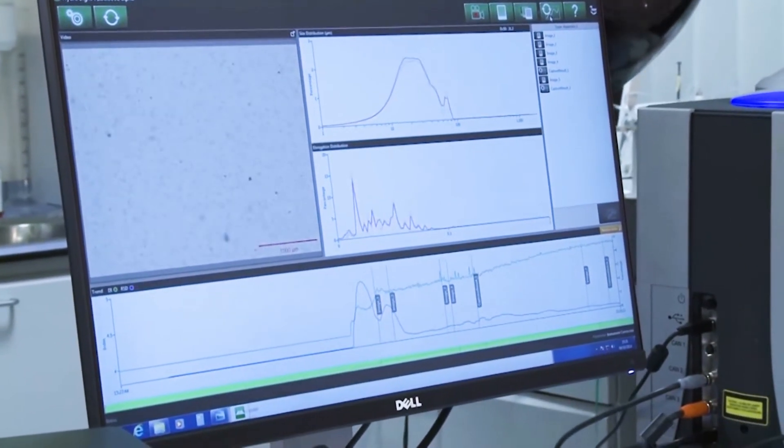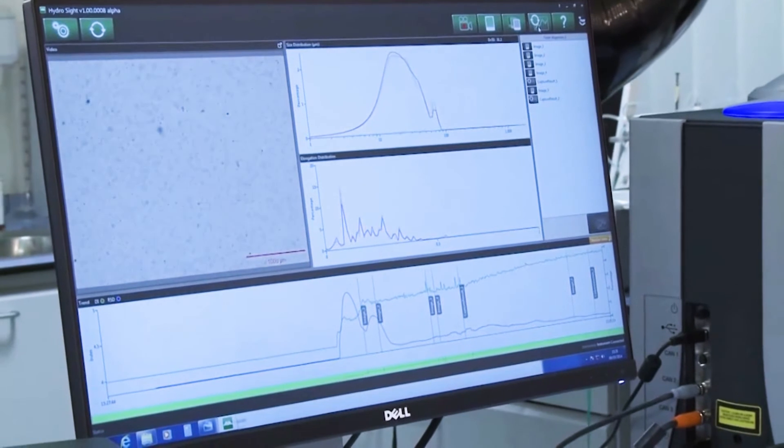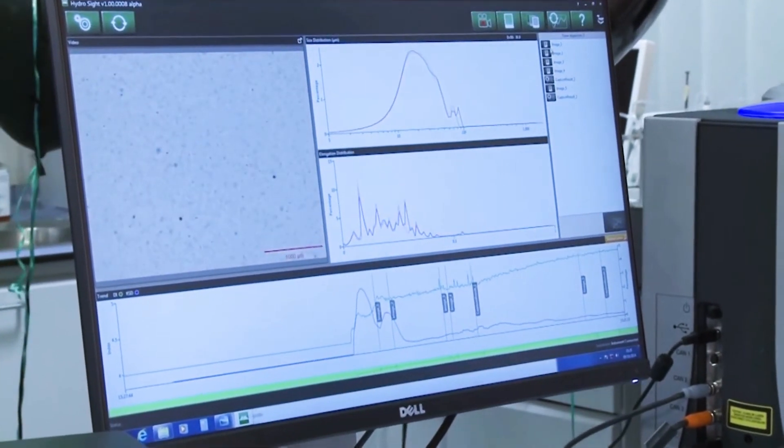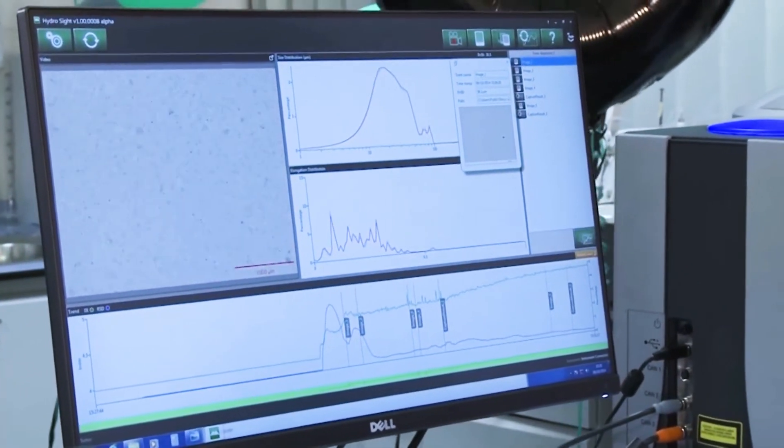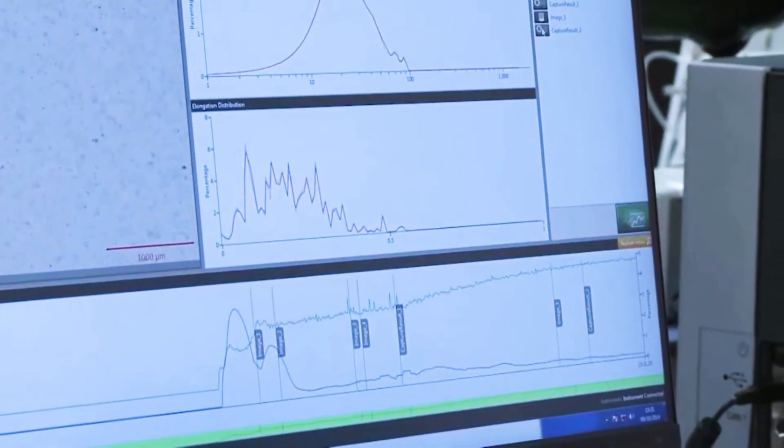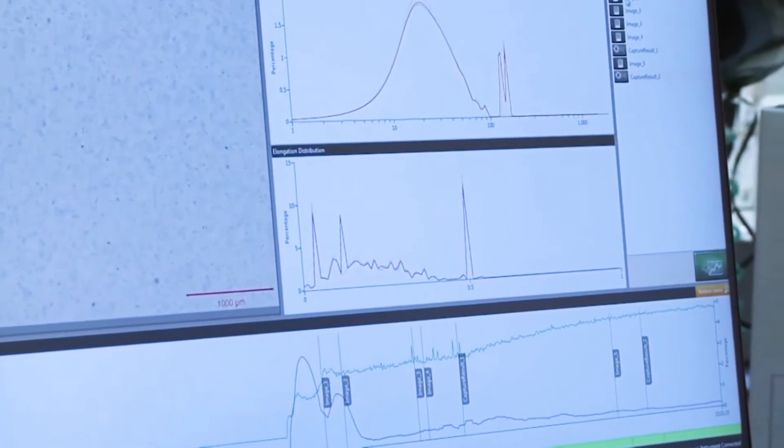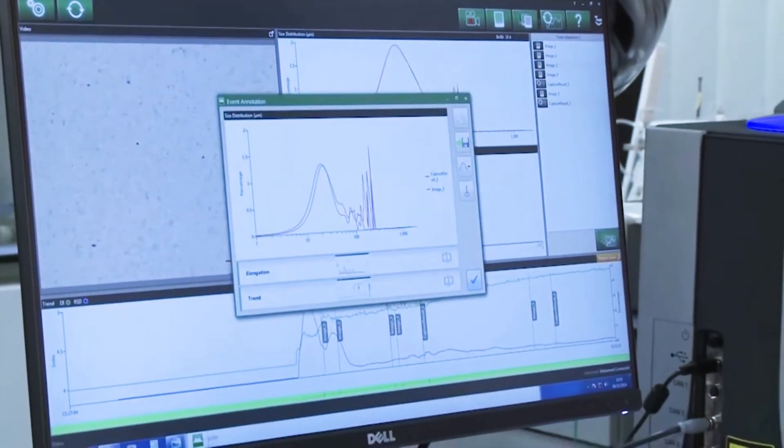So what I can do, we've been dispersing for a little while now, so I'm going to compare what's gone on sort of early on and much later. So if I open up one of these images, we can indeed see there's a few large lumps, so there's definitely some agglomerates in here. Whereas if I take this later one, there's much fewer lumps, much more small particles.